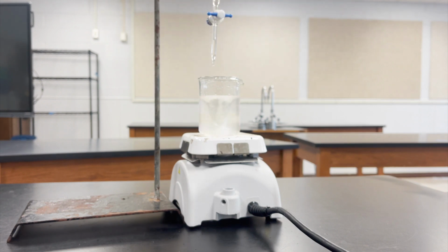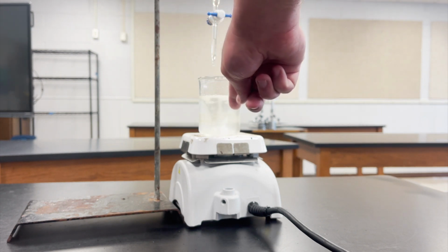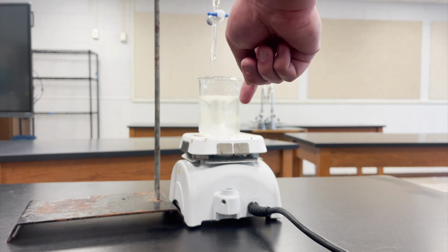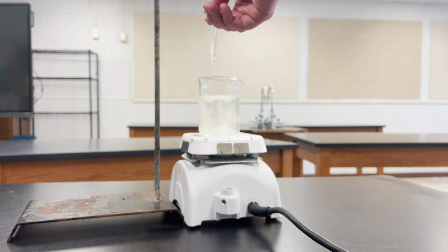Do you see the pink there? So when you put that sodium hydroxide in there, it turns a little bit pink, but then goes back to clear. The reason why it goes back to clear is because it's still acidic. There's still acid inside of there. The sodium hydroxide is neutralizing the acid when you put it in there, but we have not put enough sodium hydroxide in there yet to neutralize all the acid. And so let's go ahead and add some more.